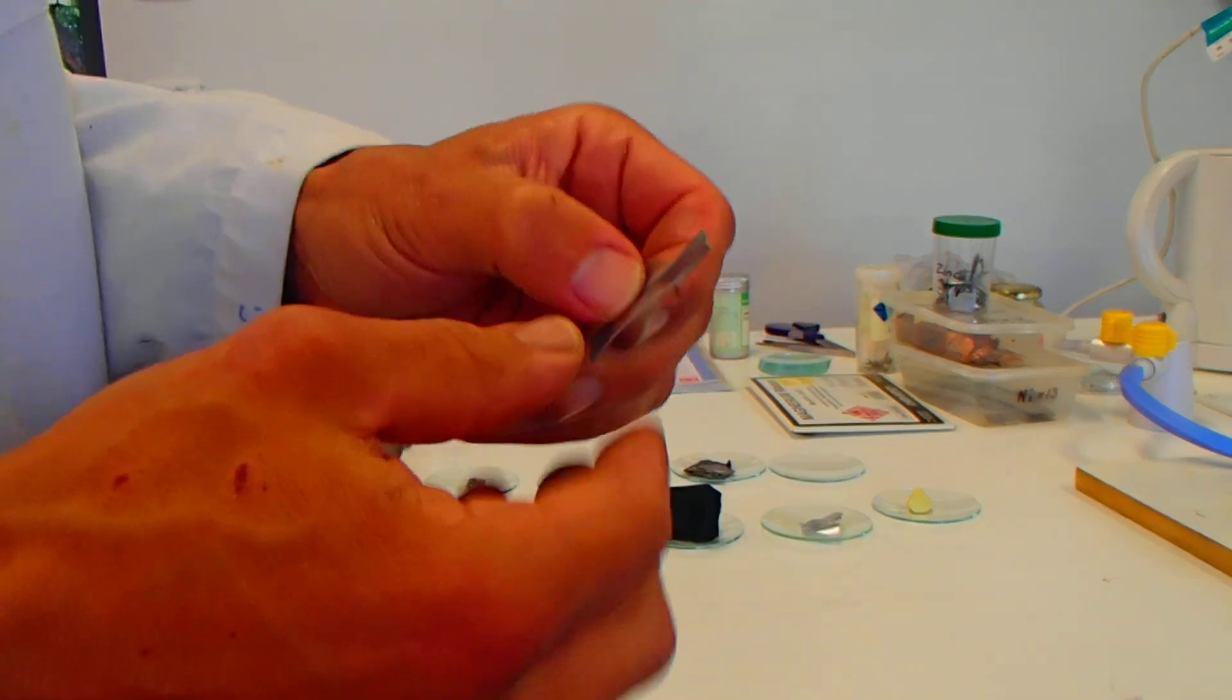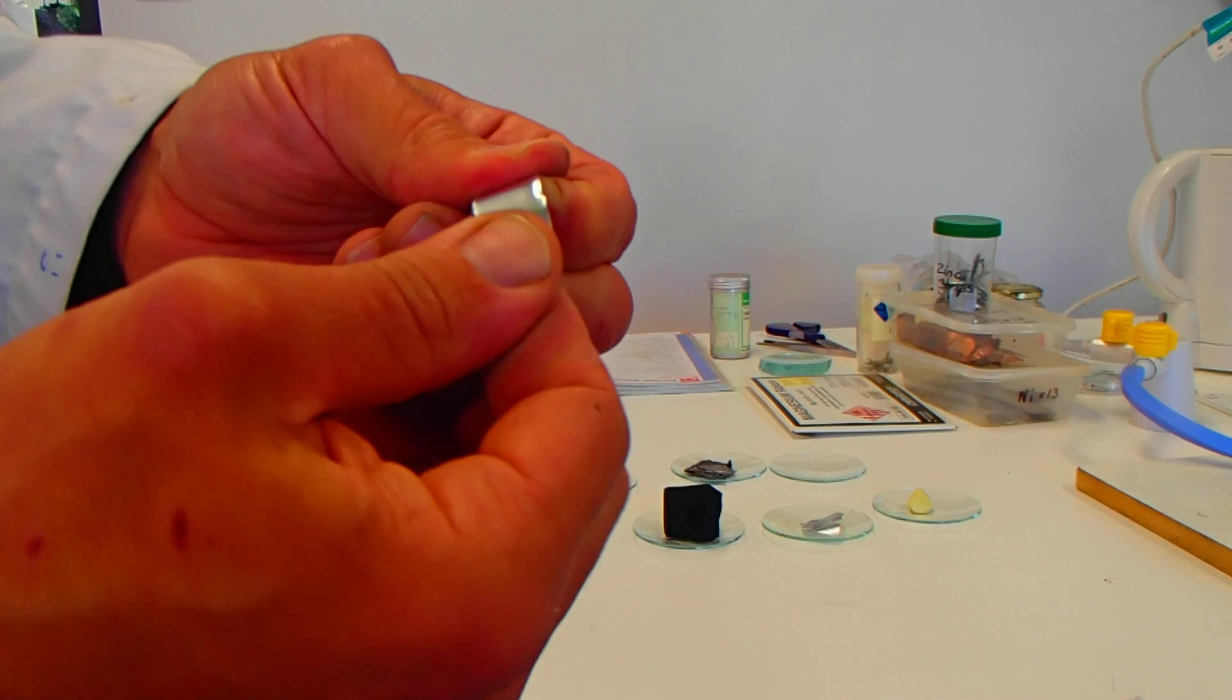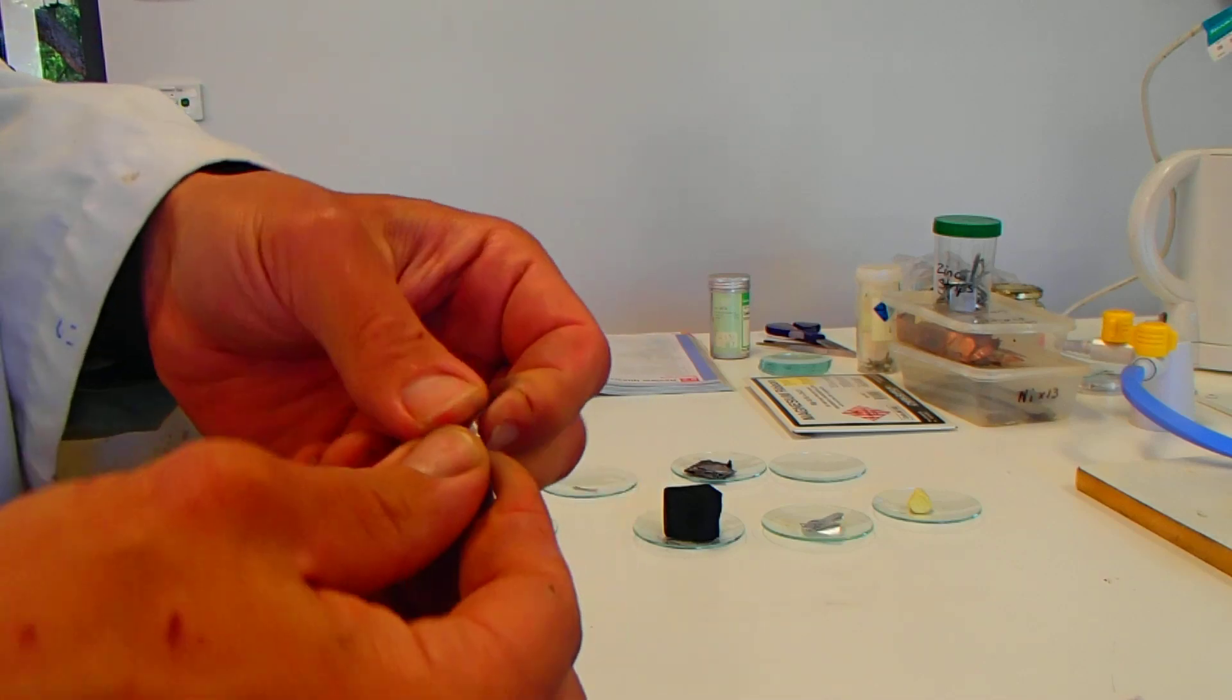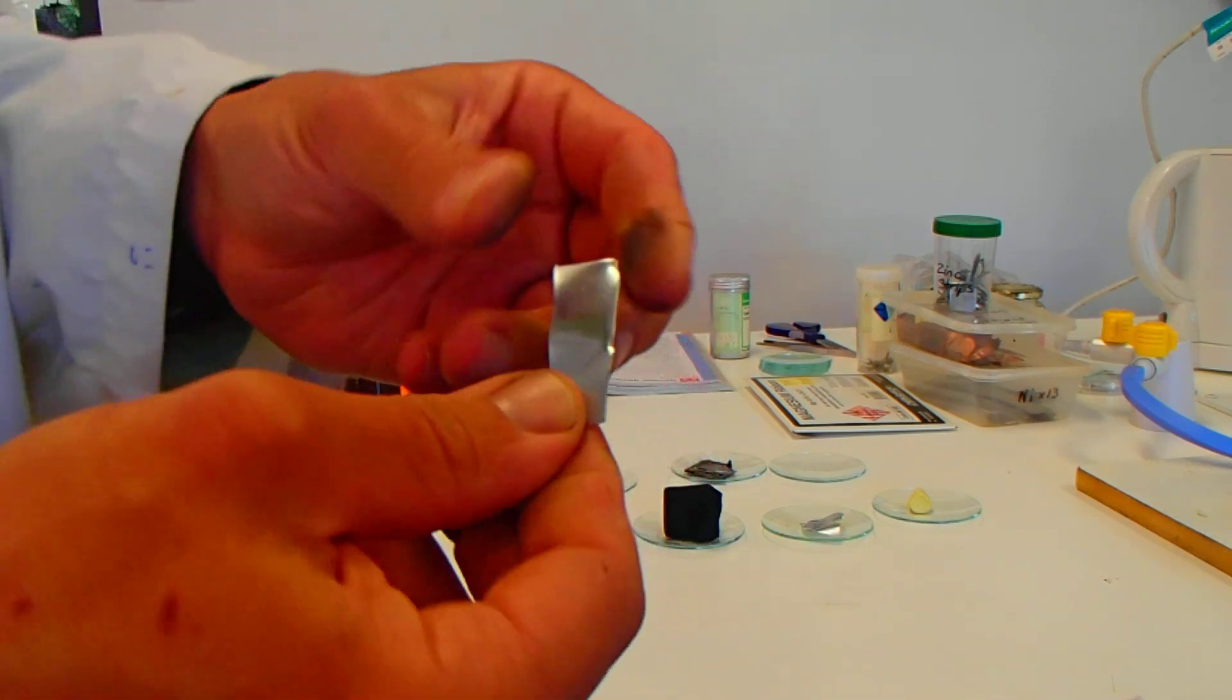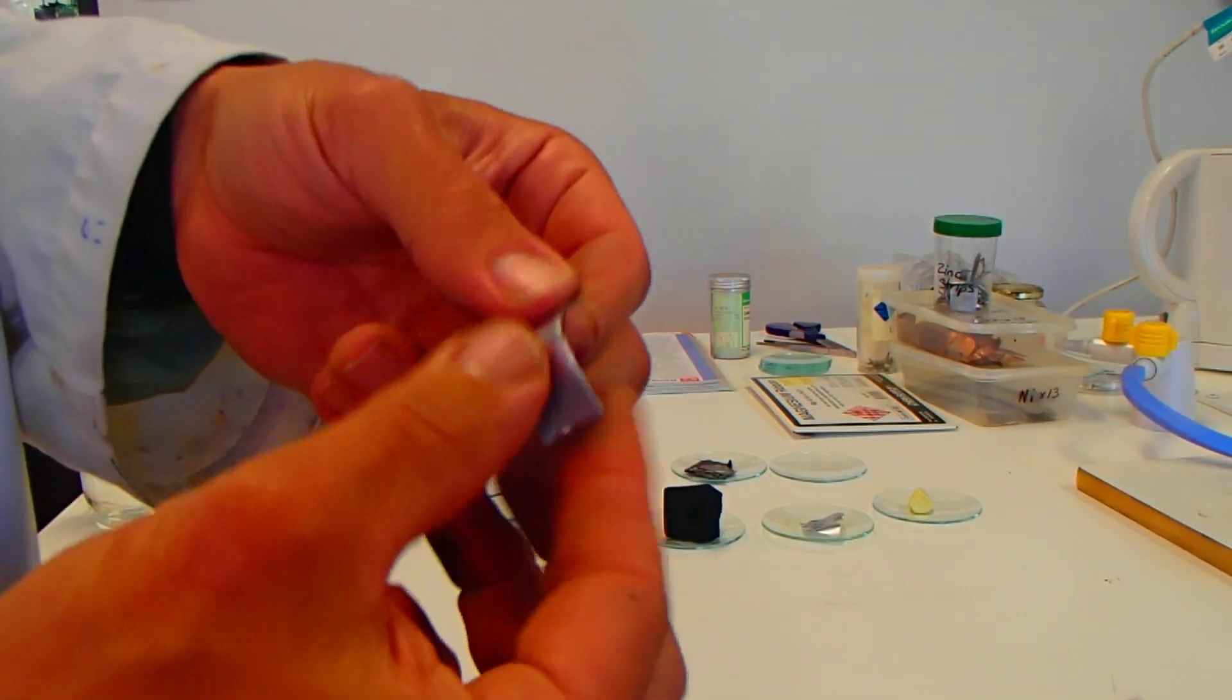We have the zinc sample. Let's have a look. Bendable, but it's quite a bit stiffer than the tin or the aluminum. I don't think I'll be able to rip this one. No. Definitely bendable, but keeps its shape. And that's quite strong.